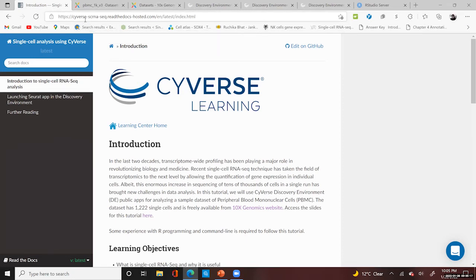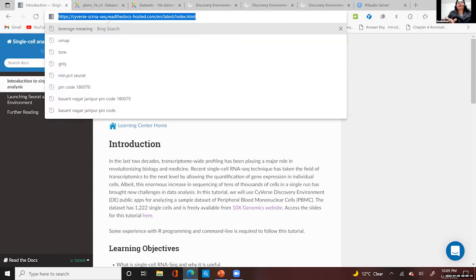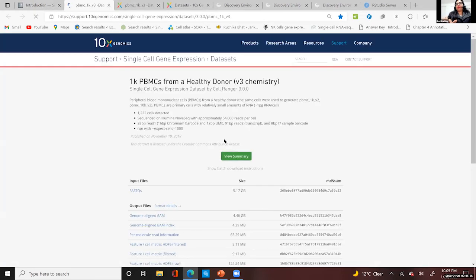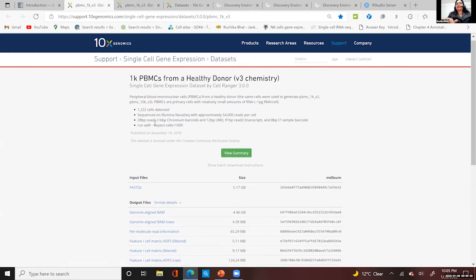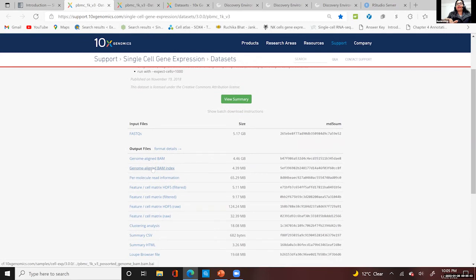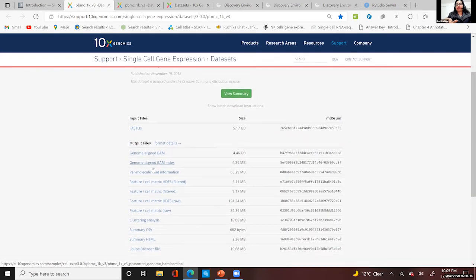Okay, thank you. So this is the tutorial which Tina will share with you after the webinar is done. Here you can see that I have taken this data set from the 10x Genomics website. If you click on this website, it will take you to the data page where I have taken the data set from, and this is freely available for anyone to use. And they also have other data as well.